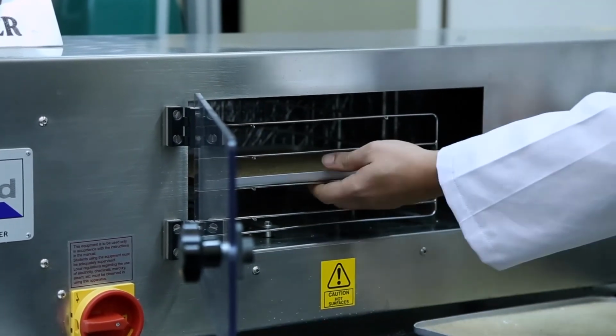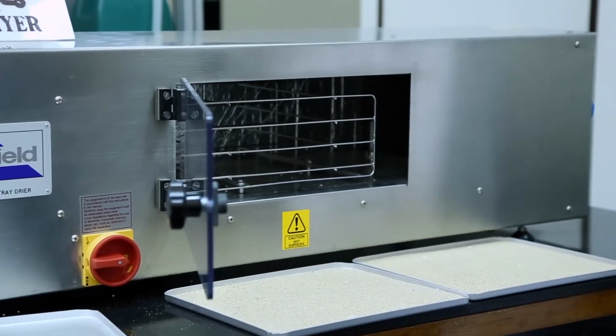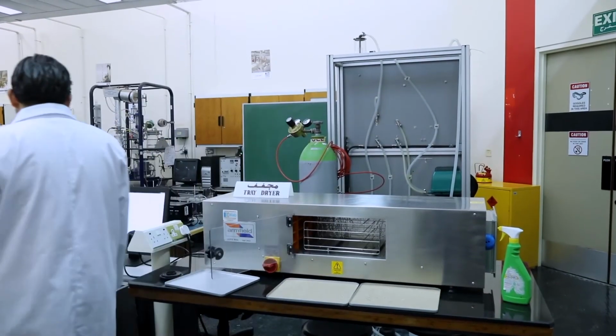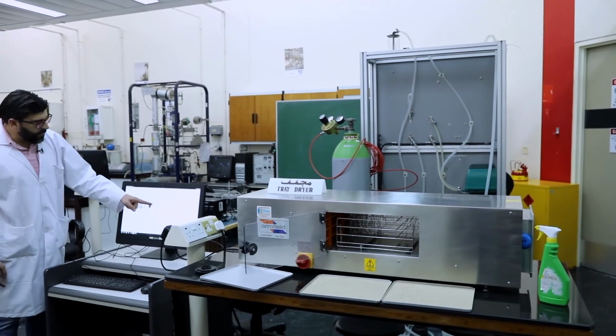So before doing this, we have to adjust the properties of the software. So now we'll go to the software to see what we should do. Now these are the parts of the trays.